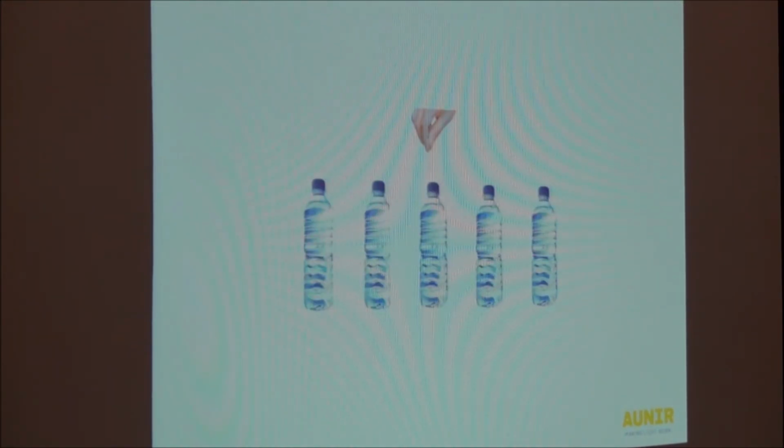NaCl and KCl. Just to give you an indication of what the detection limit is, because we talk about millimolar, 10 millimolar, for example, this is the detection limit. A pinch of salt in 5 bottles of water. So you won't forget that. So that's 10 millimolar, similar to the UV work that was reported by Dr. Mirosawa.